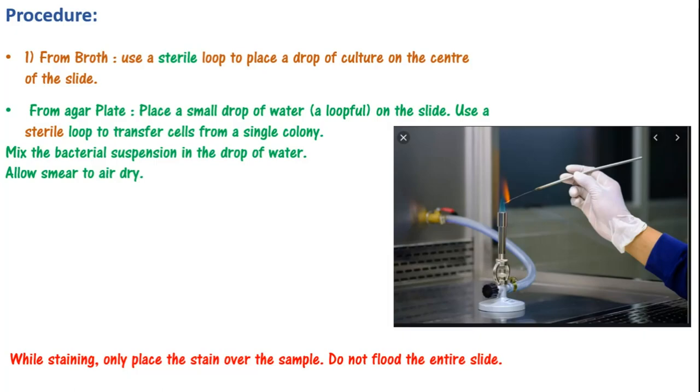Now you will add reagents. I have seen a lot of students who flood the whole slide and later they are worried about the specimen. Try to put the stain only on the sample area. Put the slide in the staining rack on the table — not in the wash basin, because there are other bacteria there. Don't flood the entire slide; put the stain only on the specimen. If you do this correctly, you will be able to see the stain right where the specimen is.